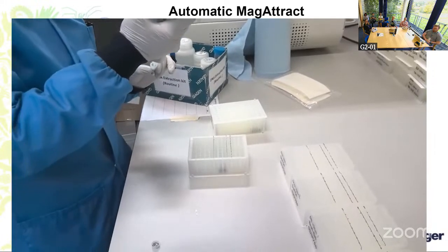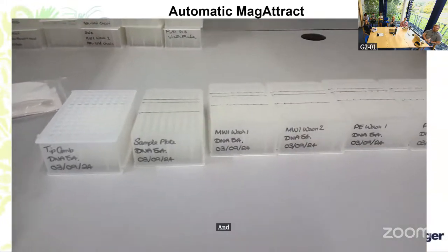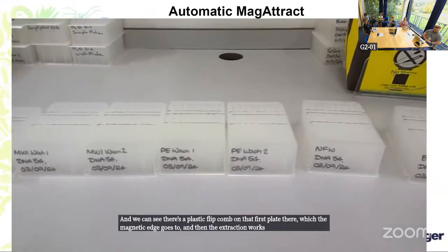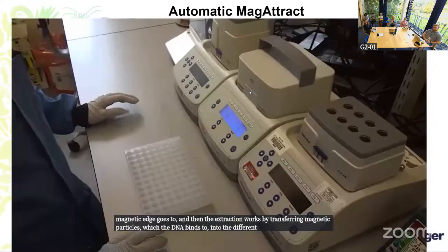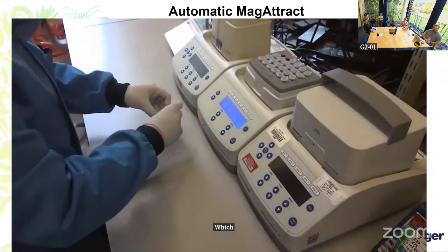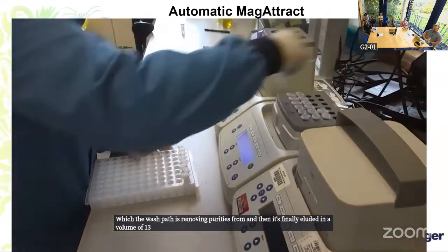So the Kingfisher works with a magnetic head, which goes into each of these plates. And we can see there's a plastic tip comb on that first plate there, which the magnetic head goes to. And then the extraction works by transferring magnetic particles, which the DNA binds to, into the different plates. There are mixing steps within each plate, and the wash buffers remove impurities, and then the DNA is finally eluted in a volume of 130 microliters of elution buffer.